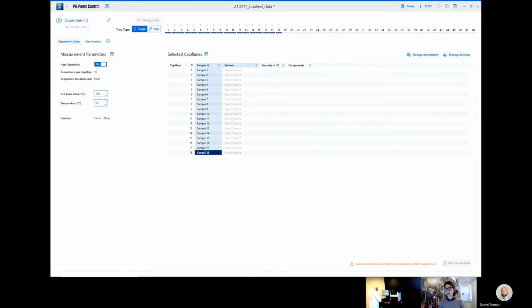I hope you're watching because this is going to be quick. There you go. So NIST MAB, I've selected all of them and made a single typing move, and it's all good to go. I'm going to select our solvent now.